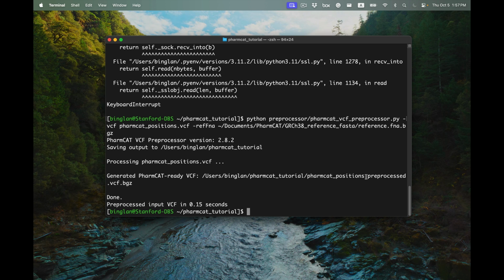Also noteworthy, since this example VCF is a relatively simple VCF file, you won't notice much difference between the preprocessed and non-preprocessed VCF. But if you have an actual VCF file generated by a sequencing lab, different sequencing labs may have quite different variant representation formats for their genetic variants, given their own bioinformatics pipelines. In this example, we just carry on with this simple example VCF.